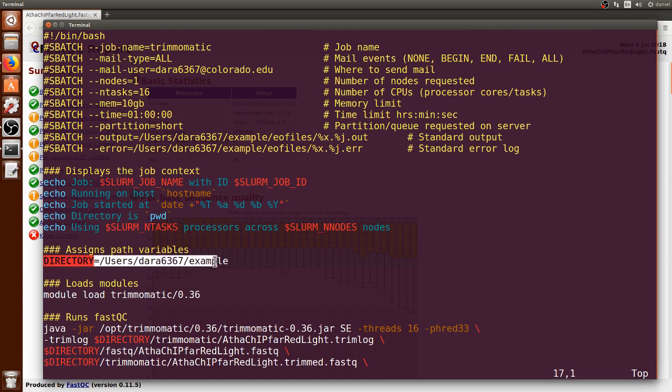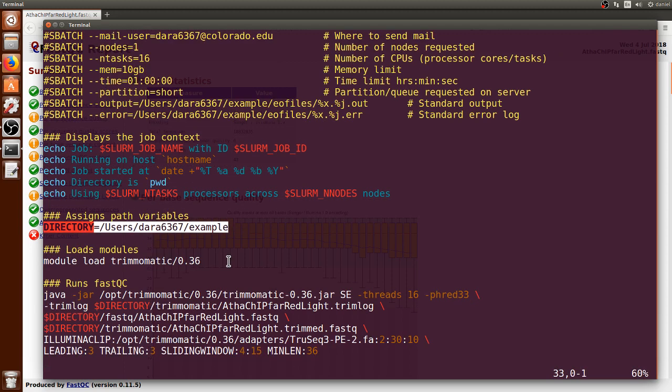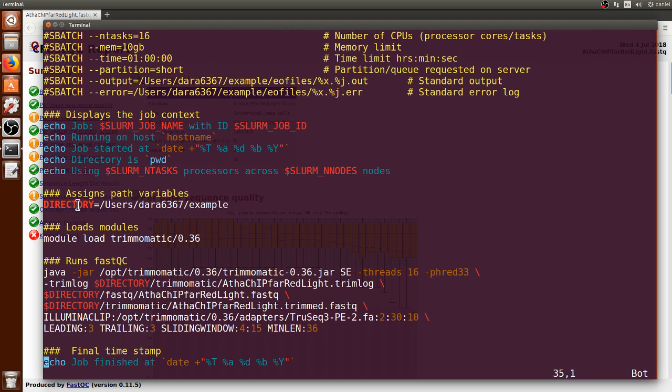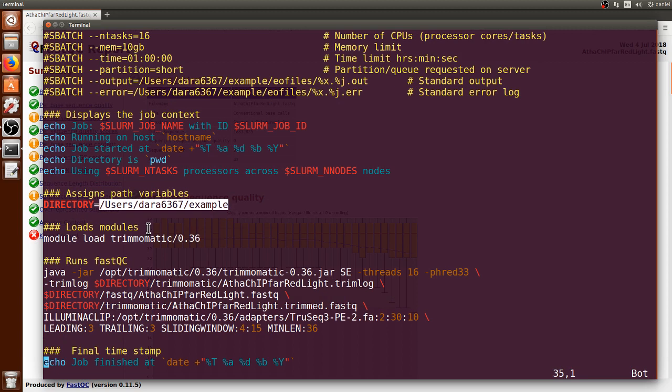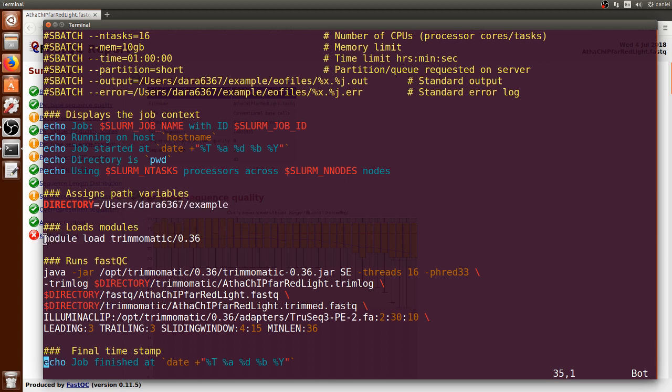Here I am declaring a variable that contains the common path that I will be using to run Trimmomatic, such that it is more clean, the command itself. Then I load Trimmomatic using module load.